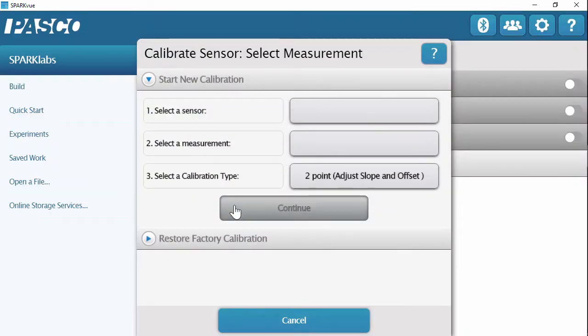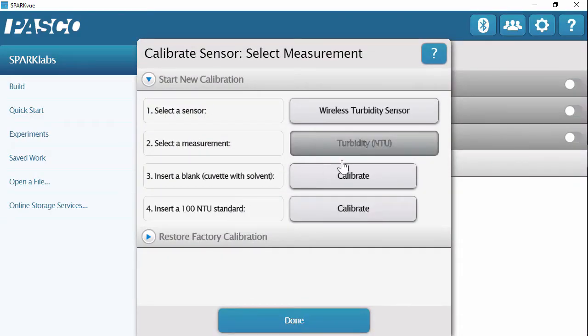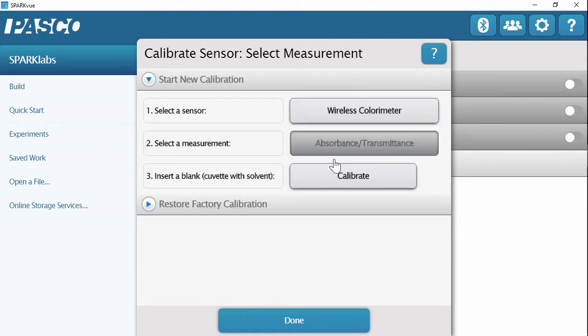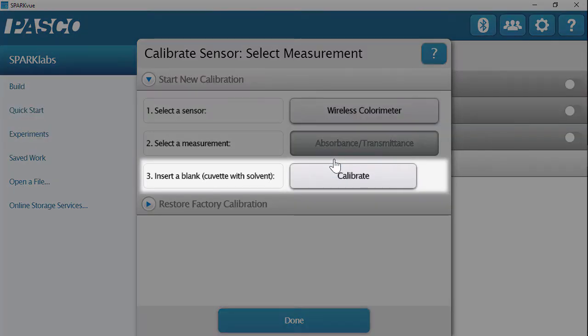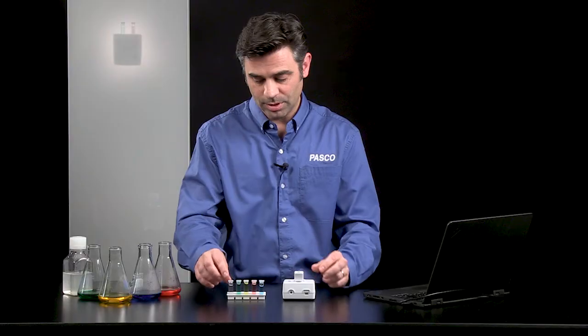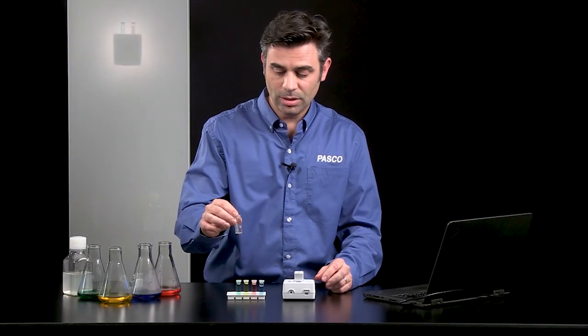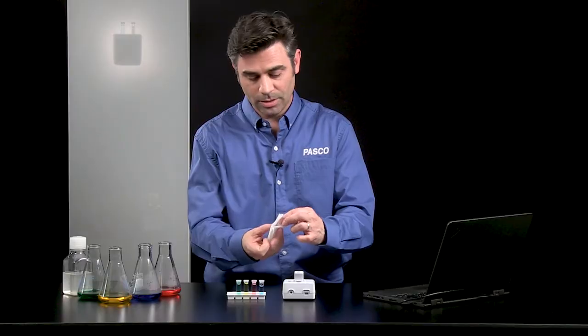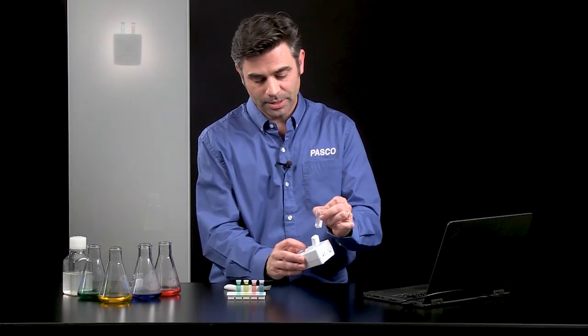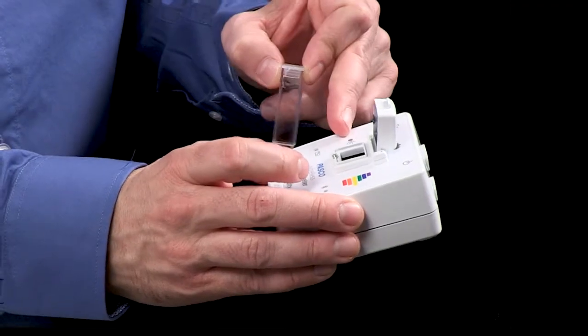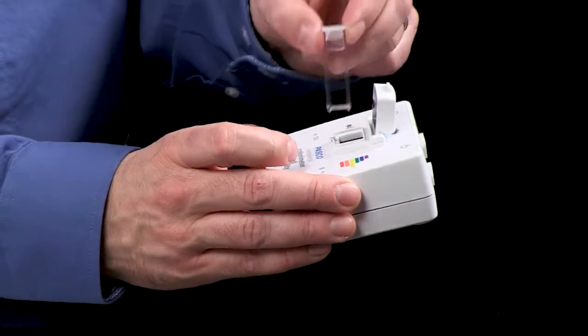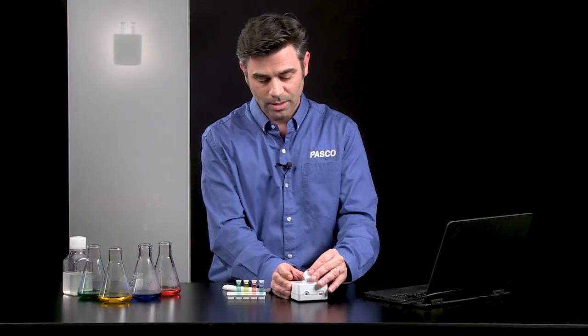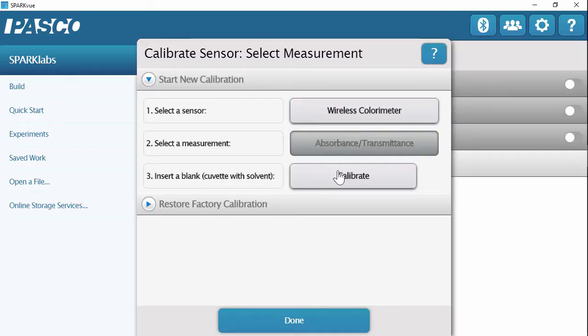So I hit calibrate, and I can calibrate either turbidity or colorimetry. In this case, I want to calibrate my colorimeter. And it instructs me about what to do. So I'm going to insert a blank cuvette, which is a cuvette with a solvent. I'm going to use the cuvettes that have ridges on the sides so that I don't touch the cuvette where the light is going to go through. And I'm going to put that into the colorimeter so the light goes through the clear side over to the detector. And I know that the detector is over here because of the rainbow. I'm going to put that in. I'm going to hit calibrate.